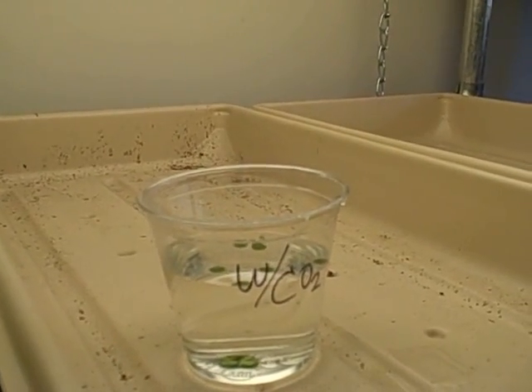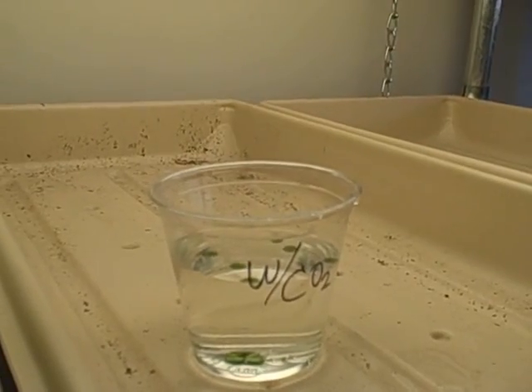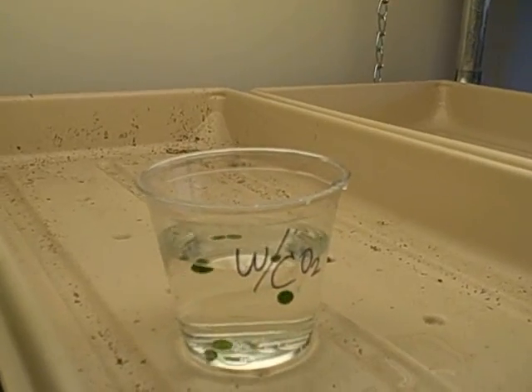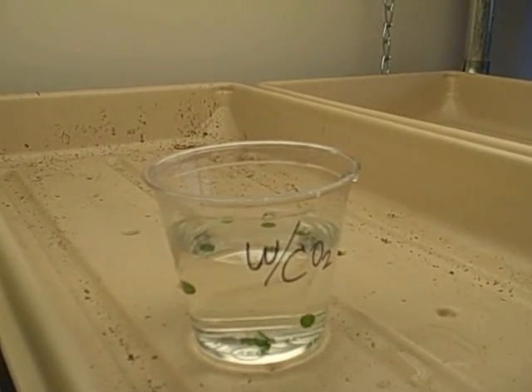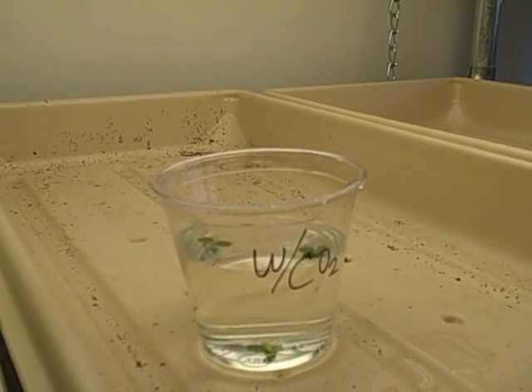At the end of seven minutes we have five discs floating. I give it a little swirl, and I'd guess that by the time we get to eight minutes they'll all be floating. Another good reason to swirl them is to keep them from sticking to each other, which they sometimes do.